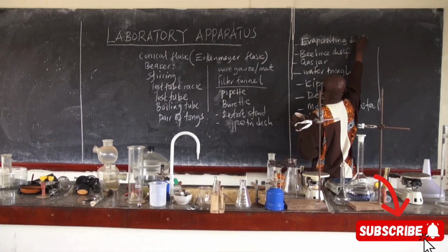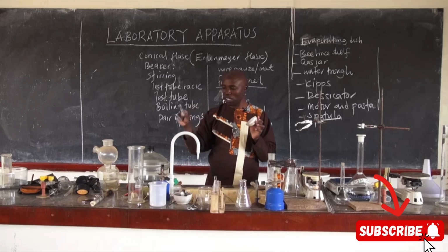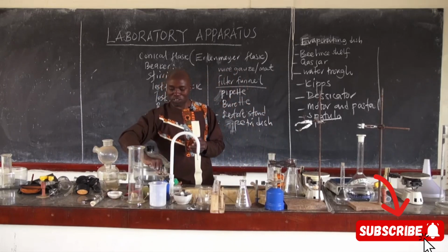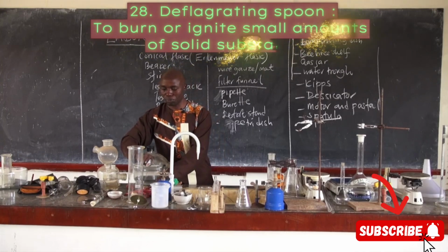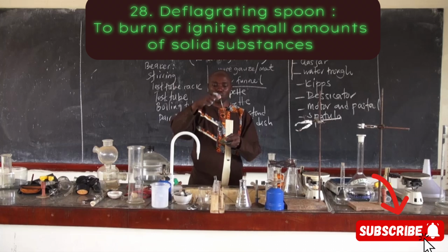We have a crucible, but I don't have it here, because there are so many to pack and remember. But you'll meet it as we do several experiments.